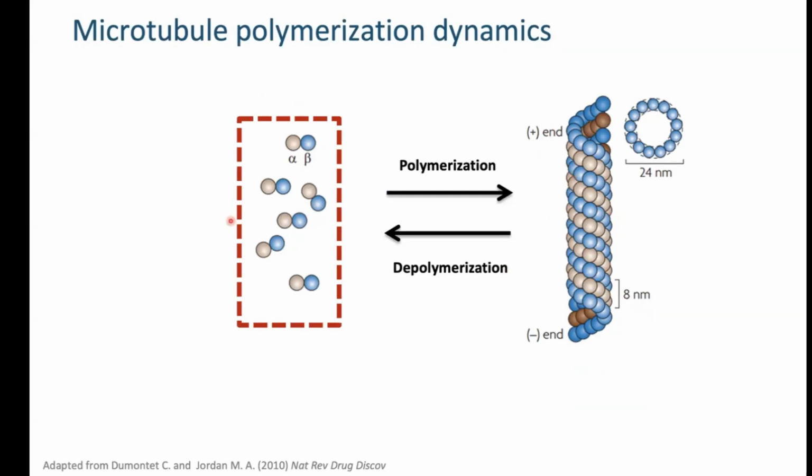And in this work, I focus on the first step of microtubule polymerization, the interaction with tubulin, which is basically the building blocks of microtubules. But in order to capture this interaction, you need to go to a single molecule level, because tau decreases the critical concentration for tubulin polymerization. Even a small amount of tau will immediately shift this equilibrium in this direction. So in order to look for unpolymerized tubulin, you need to go to a single molecule level.